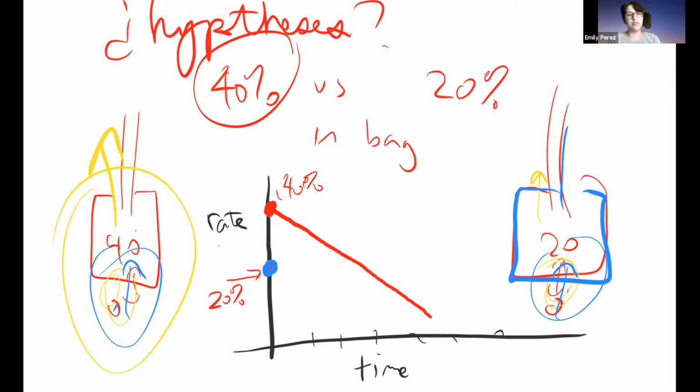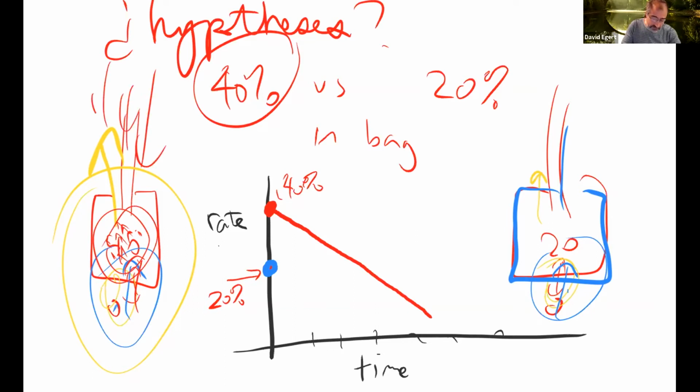A lower concentration gradient. So one is a lower concentration gradient. The more water comes in, the heavier the column gets, and the hydrostatic head increases. So we have both diluting the concentration in here, so there's a lower osmotic pressure, plus increasing the level of this column of water means there's more gravity pushing down. Both of those things together cause this to get slower and slower as time goes on until we hit some equilibrium where there's no movement at all.